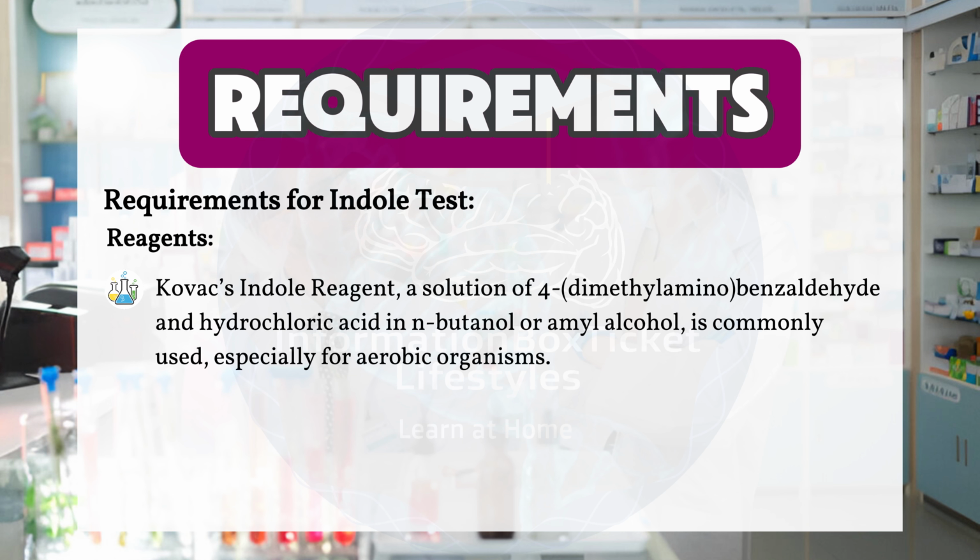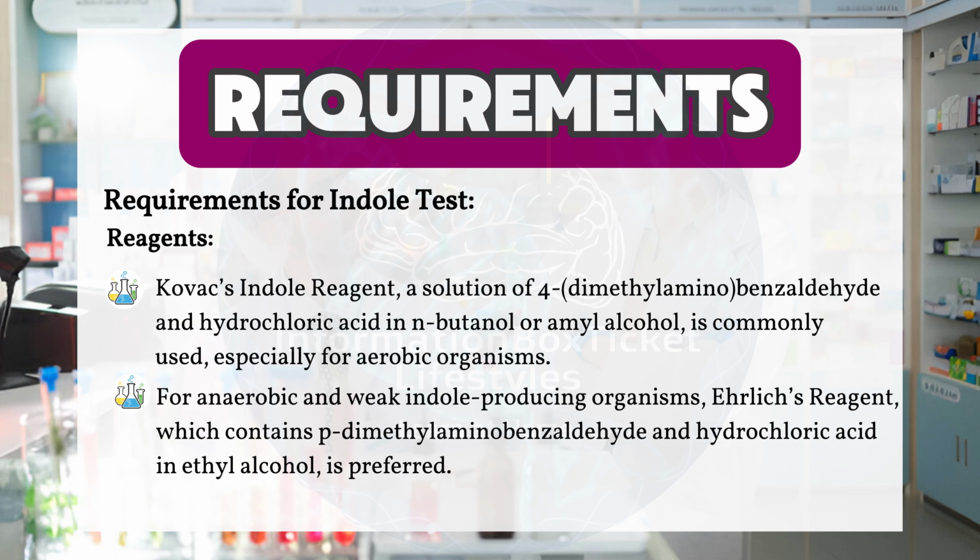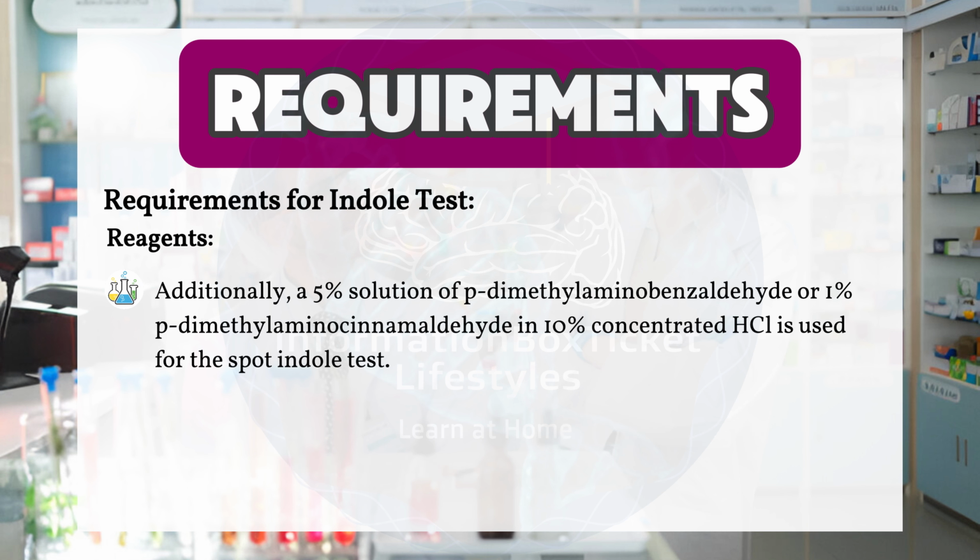Reagents. Kovacs indole reagent, a solution of 4-dimethylamino-benzaldehyde and hydrochloric acid in N-butanol or amyl alcohol, is commonly used, especially for aerobic organisms. For anaerobic and weak indole-producing organisms, Ehrlich's reagent, which contains p-dimethylamino-benzaldehyde and hydrochloric acid in ethyl alcohol, is preferred. Additionally, a 5% solution of p-dimethylamino-benzaldehyde or 1% p-dimethylamino-cinnamaldehyde in 10% concentrated HCl is used for the spot Indole test.